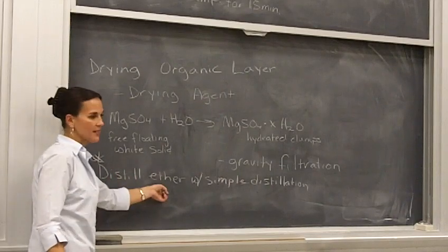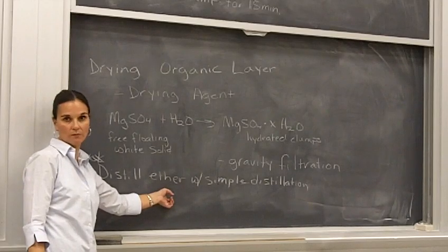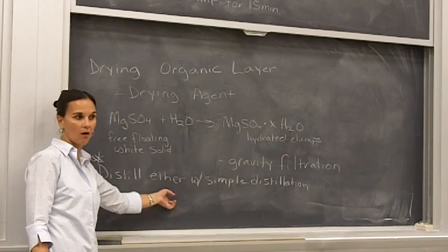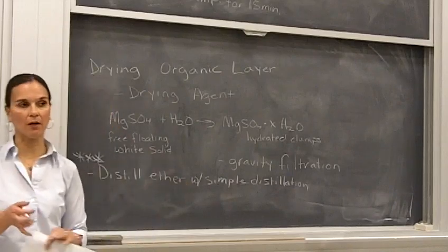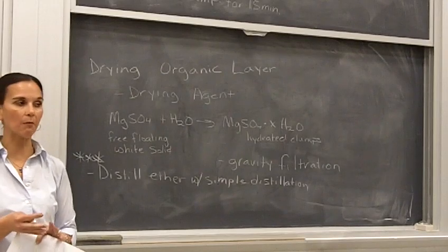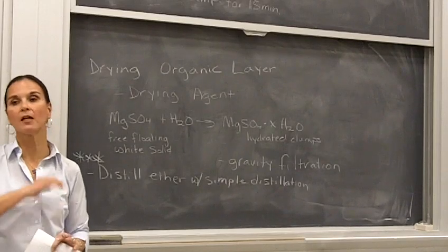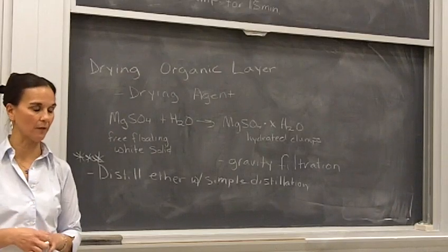So at least get to this part. If you get to the fractional distillation, then you may do that this week as well, all right? And then we'll store alcohol until next week. It also talks about in your lab manual, we are going to analyze this with gas chromatography, which we'll talk about next week. We will not prepare the samples for gas chromatography until next week. Okay, so we will do all that next week.